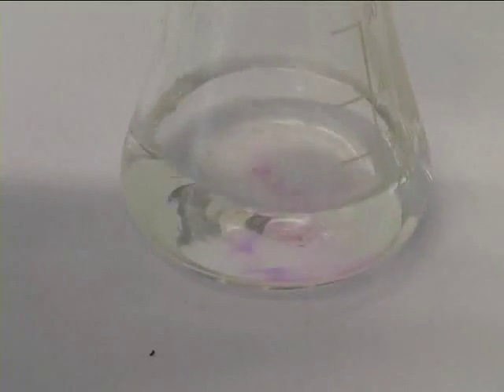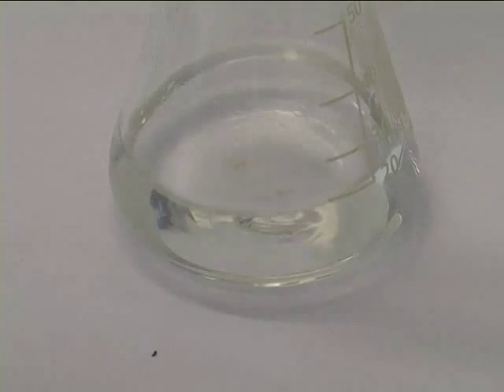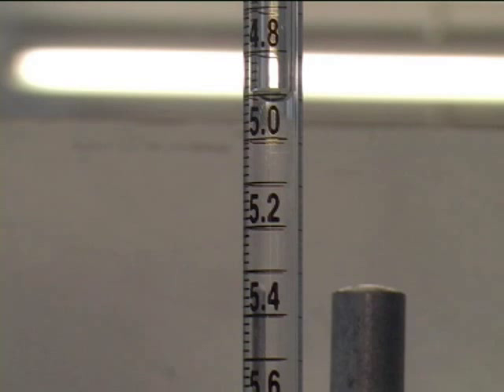This makes your reading much more accurate, which is very important in this technique, since your final results must be within 0.1 milliliters of each other. This is known as concordant results.